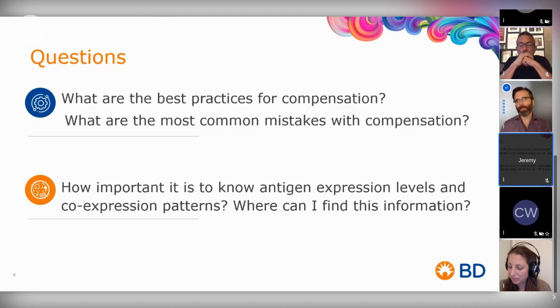So I think, thinking along these lines, you need to use exactly the same vial to assure that you're using exactly the same fluorochrome. I think that is the most important aspect. Of course, this is one of the rules of compensation. Then there are other rules that are commonly overlooked.